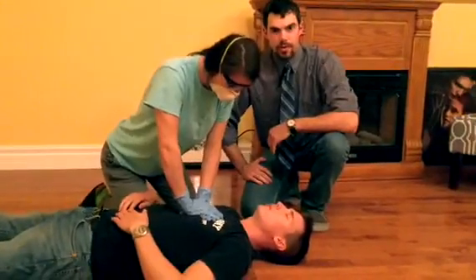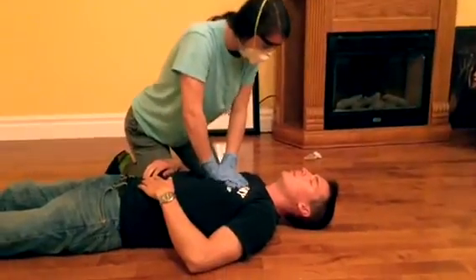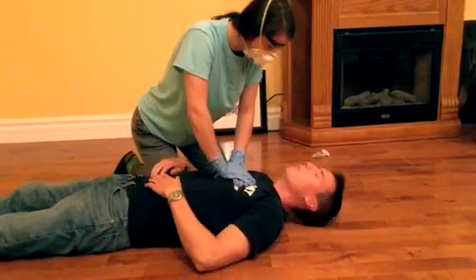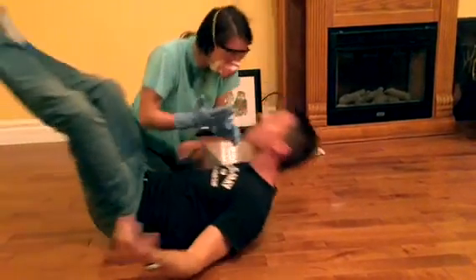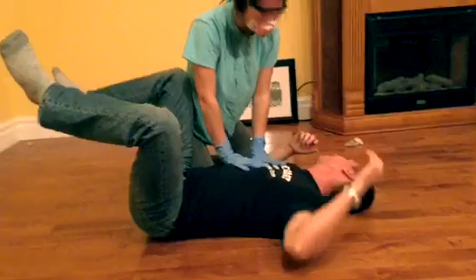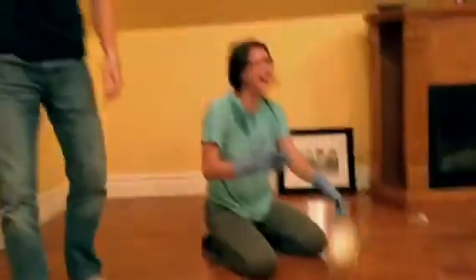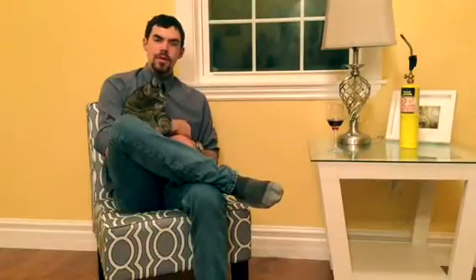As you can see, his eyes and mouth have been protected. This here is a more practical use of the combination of the safety glasses and the N95 mask. This concludes tonight's episode of Professional Practice. I hope it was a very educational experience for you and I hope you'll tune in next week. Until then, stay safe and be classy.